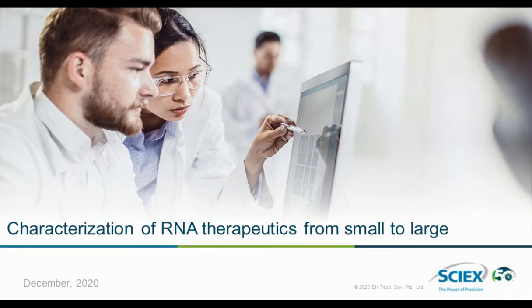Today I'll be talking about, as mentioned, the characterization of RNA therapies from small to large. I've been working in the biopharma industry for over 20 years, supporting the industry with developing methods for characterizing biopharmaceuticals. RNA is one of the growing areas of research in the biopharmaceutical industry. So what I'd like today is to go through some of the solutions that science is producing for this space.